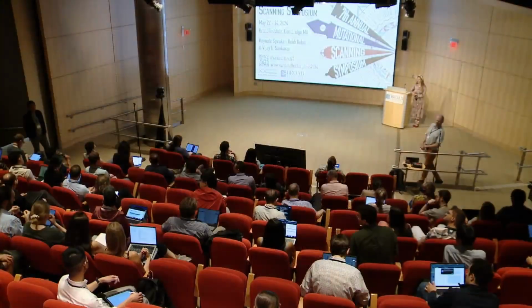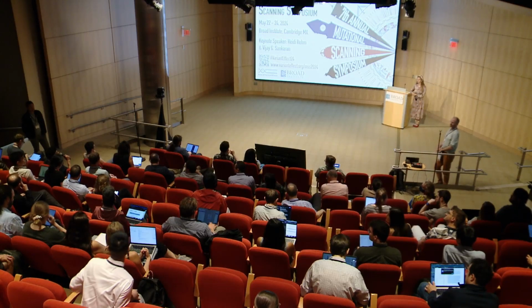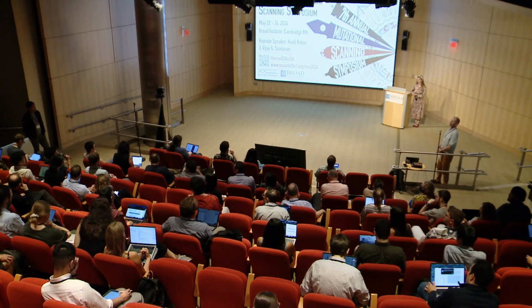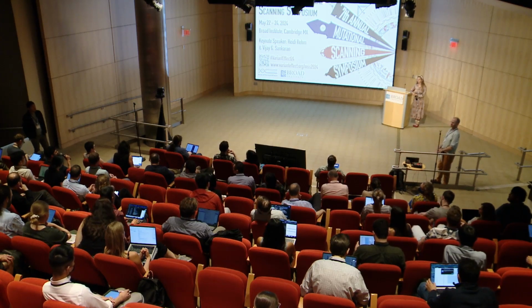Hi. Yeah, thanks for a really nice overview. Cheers. I was just wondering, because we often have issues of silencing of the base editors over time, so the editing starts high and then drops off. Do you have that issue? Do you have any ways you can get around it with the overexpression, and do you have to single cell clone every time? I was wondering what your success rates were, basically.